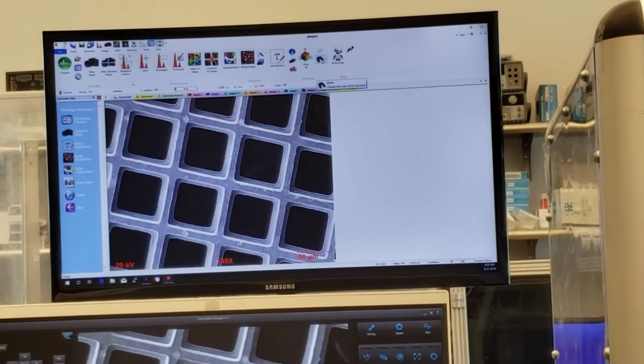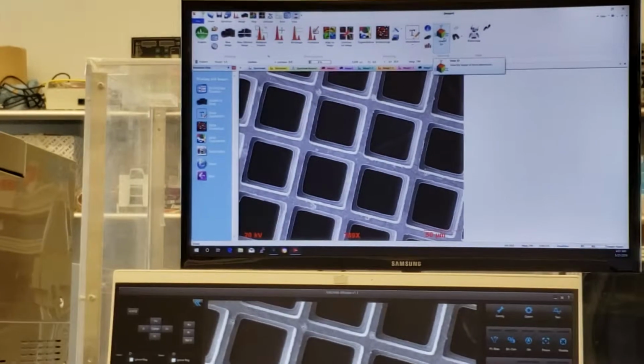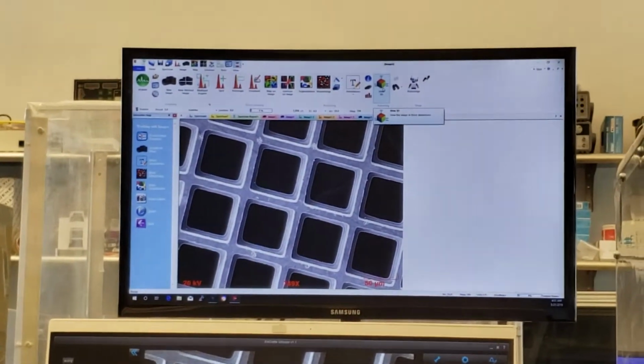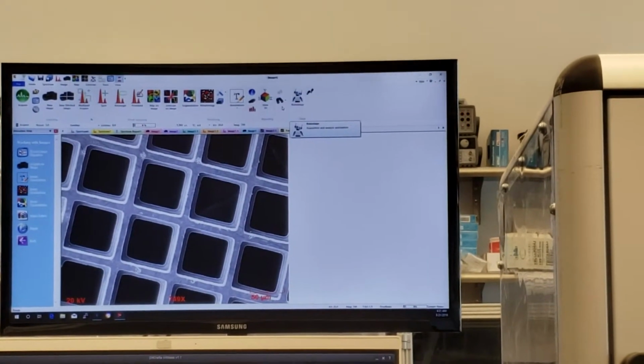And then height is not proportional, right? I'm sorry? The height is not proportional. It's working off of intensities. Be careful with that. The grid bar is not that. It's working off brightness. And then Robo Stage, you don't have that for right now.